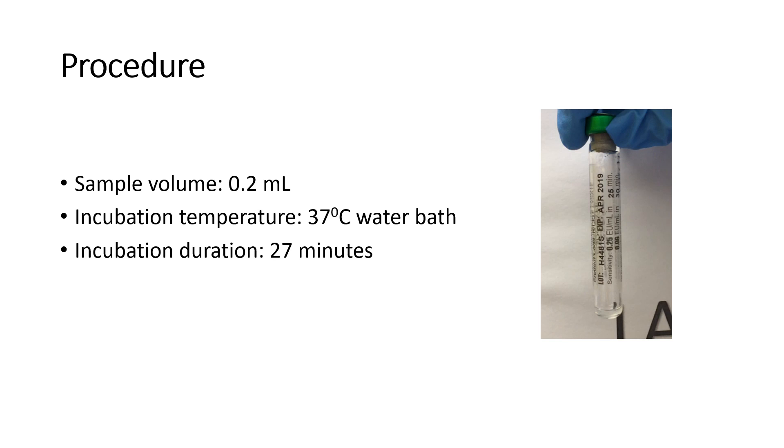The LAL test vials were subsequently placed in a 37 degree Celsius water bath for 27 minutes to achieve the desired sensitivity of 0.25 EU per milliliter.